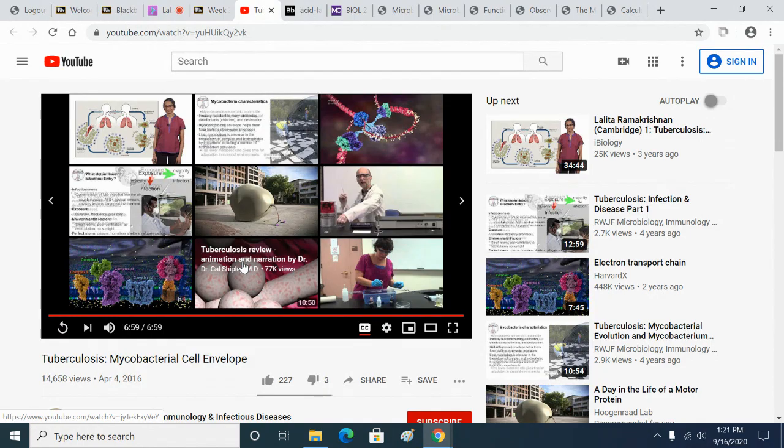And you're going to see that in this video where they refer to Mycobacterium as Michael bacteria. So Michael, as in the name Michael. And you'll see some other weird things like mycolic acids. They call them my colleague assets.